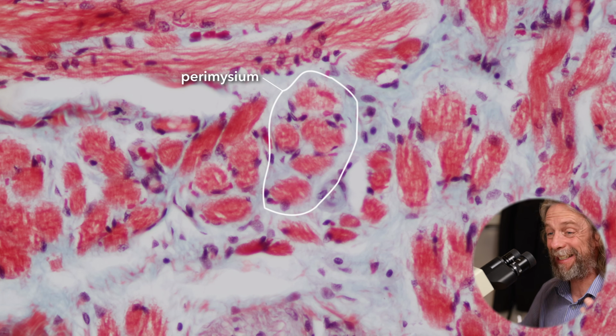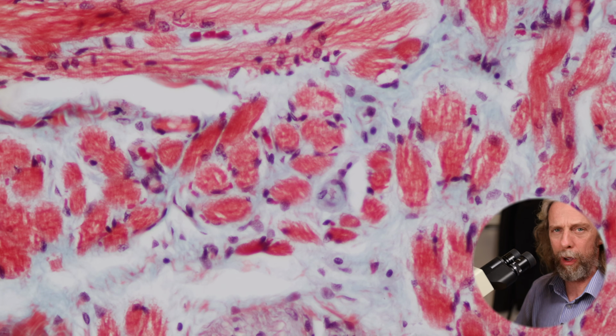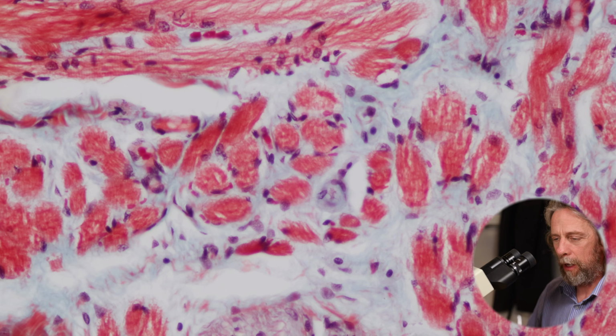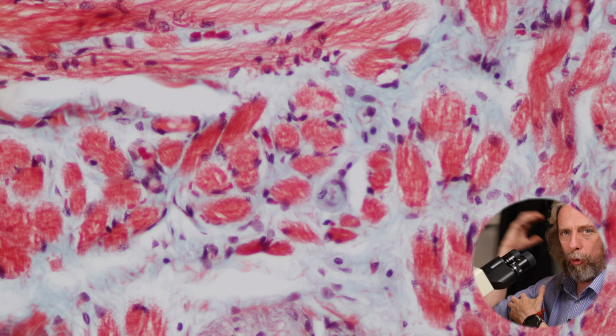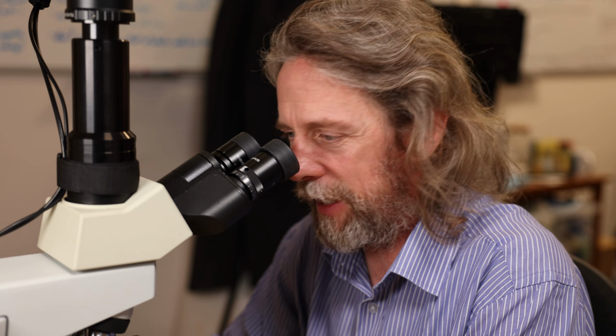The muscle needs to generate a lot of force, which is why I'm struggling with the word strength. But that connective tissue is part of keeping the muscle together, but also part of the muscle pulling on other parts of the muscle. It's part of the contraction machinery, really, right? So as the muscle cells get shorter, the connective tissue supports all of that and pulls everything together so the whole muscle gets shorter. Am I making any sense?